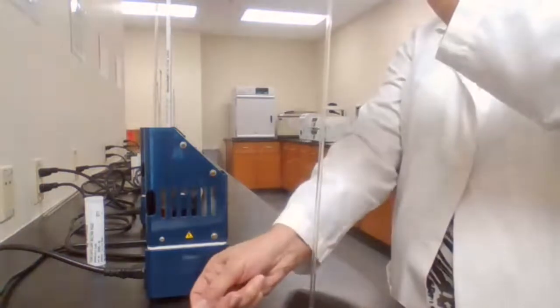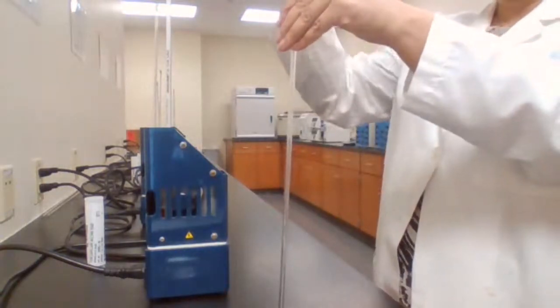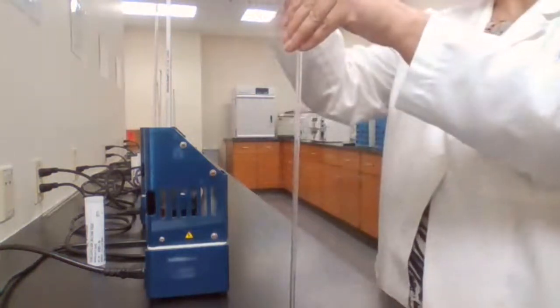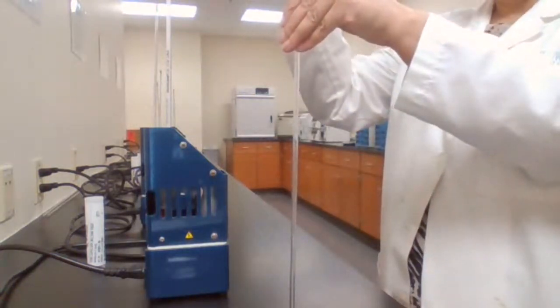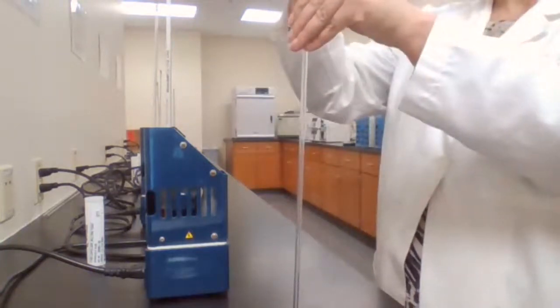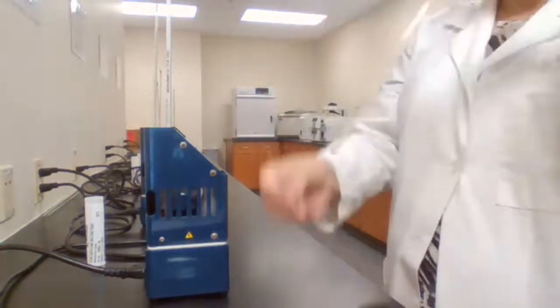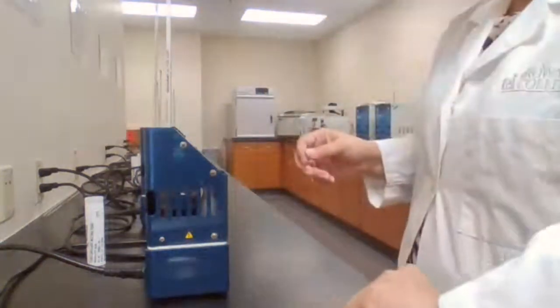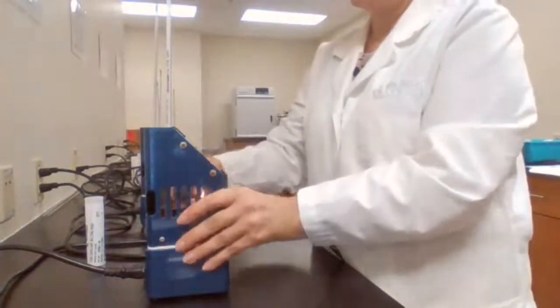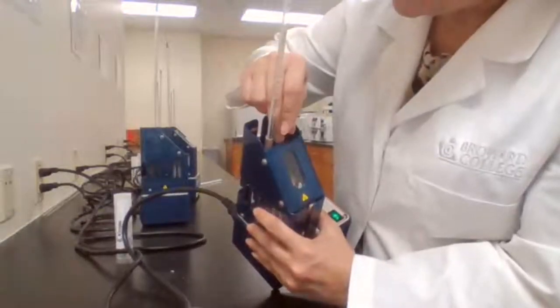Pass it through the hollow glass tube a few times to get the sample all the way down. Then I can place it into the sample holder of the melting apparatus.